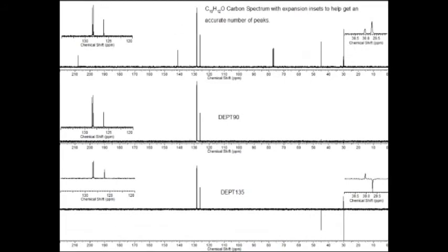Looking at the carbon spectra, it certainly confirms the aromatic ring, with its 4 carbon resonances representing 6 total carbons in the aromatic region between 120 and 140 ppm. The quaternary carbon here at 140 ppm is certainly the carbon where the substituent connects to the benzene ring. There are 3 upfield peaks, 30 to 45 ppm here, certainly the methyl and the 2 methylenes, and consistent with what we see in the proton spectra.